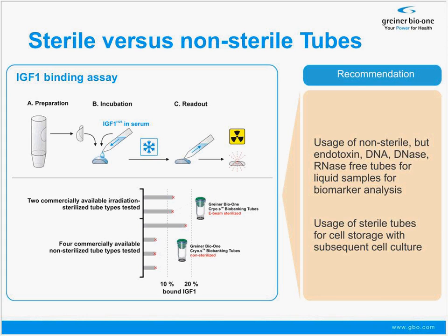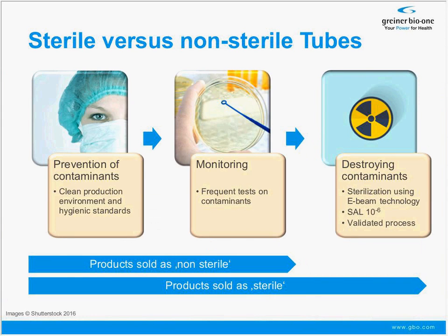And as I mentioned before, the idea here is to develop a better idea what is a good recommendation for each type of application, and it would also be interesting to assess how other types of molecules behave. IGF-1 is a small peptide, there are lipid substances, there are polysaccharides. It would be interesting to see how these substances behave in this test, and there may be more research going on in the future.